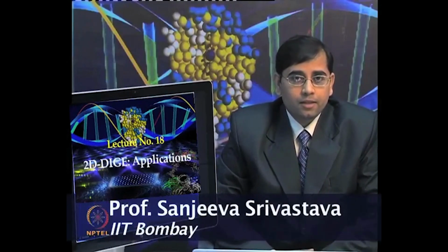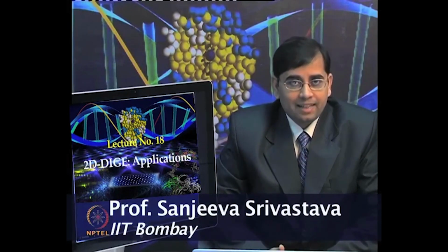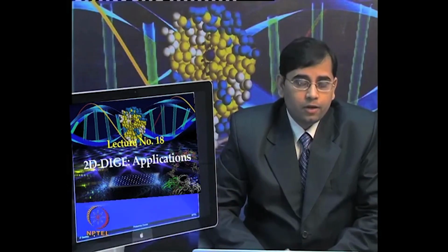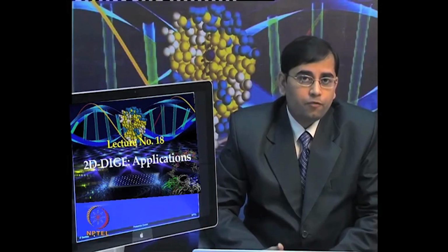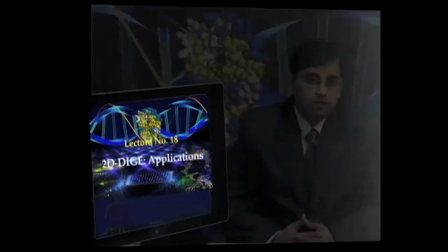So I hope our discussion with Dr. Srinivas was useful, and now you can perform these analyses using specialized software and obtain very useful biological information from your data set. You must appreciate that many meticulous steps are involved in performing these experiments, but in the end this provides a very useful quantitative multiplexing approach to separate proteins and analyze different types of variations.